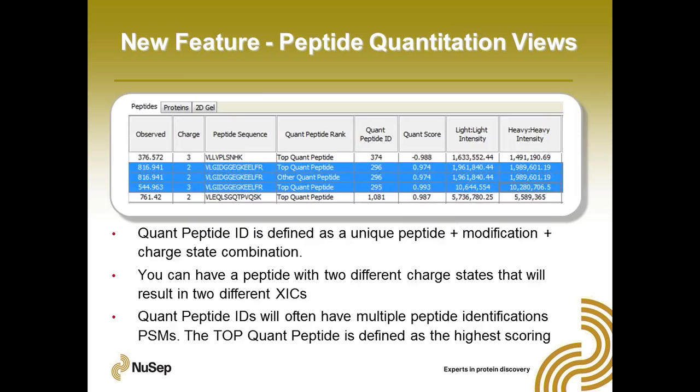So let's talk a bit about peptide organization in the tables. We commonly get questions about this, so I did want to address it today for those of you that are here.